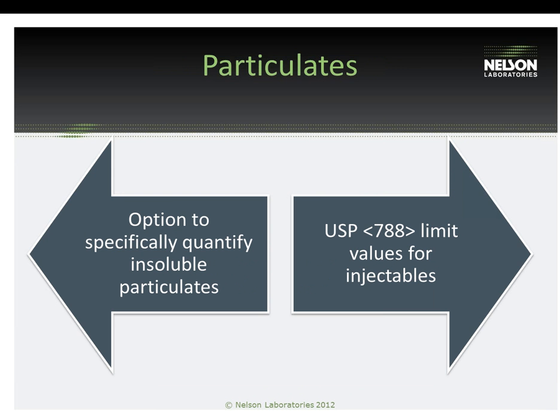The next test option that we are going to discuss is the particulate test. With this test method, we also do a device extraction, and then we run that extract through the liquid particle counter to get a quantitative amount of particulates left behind.